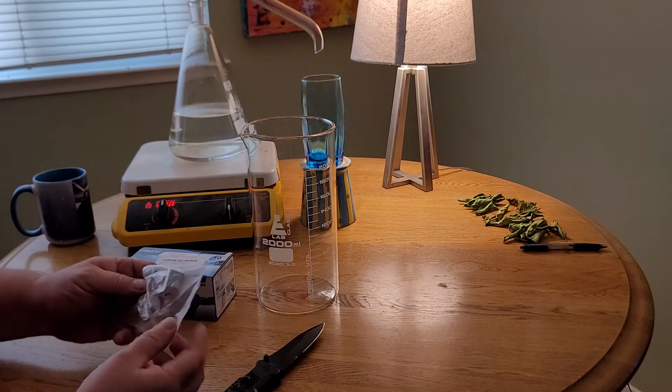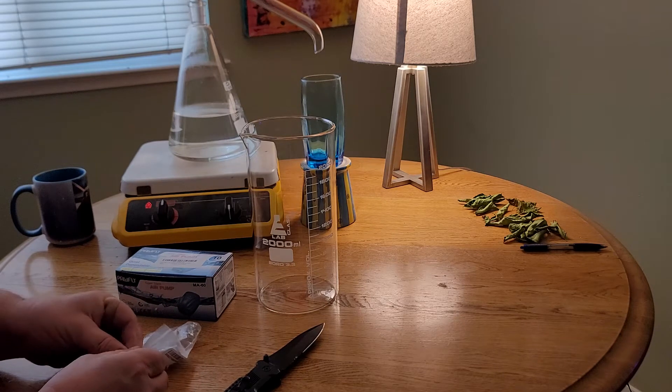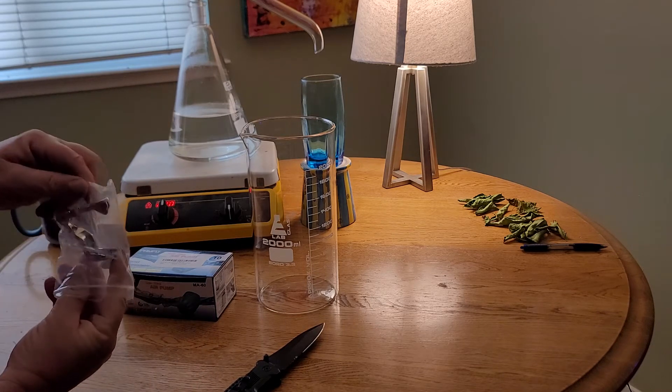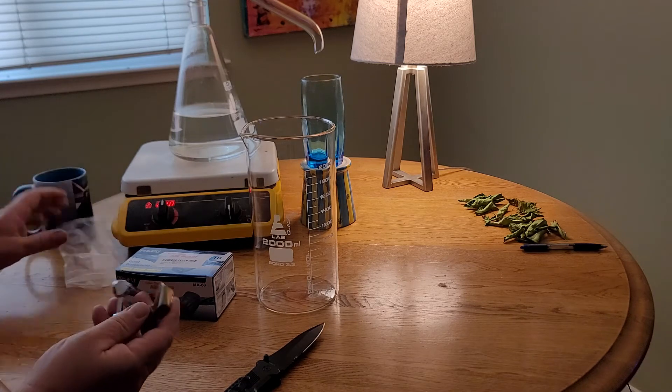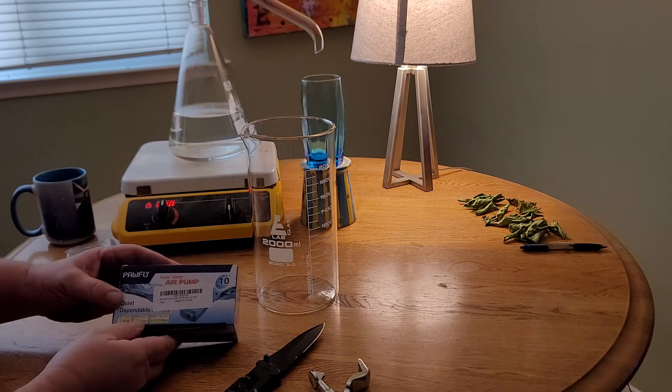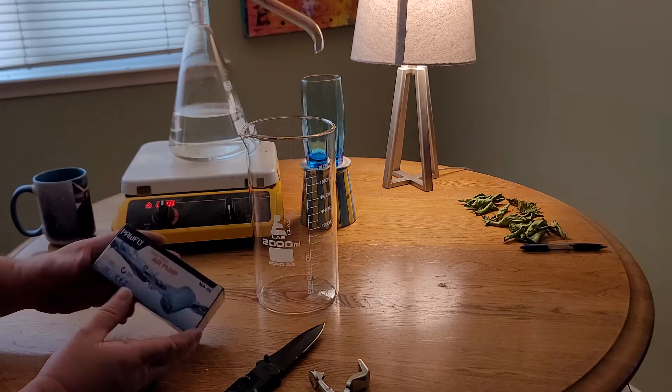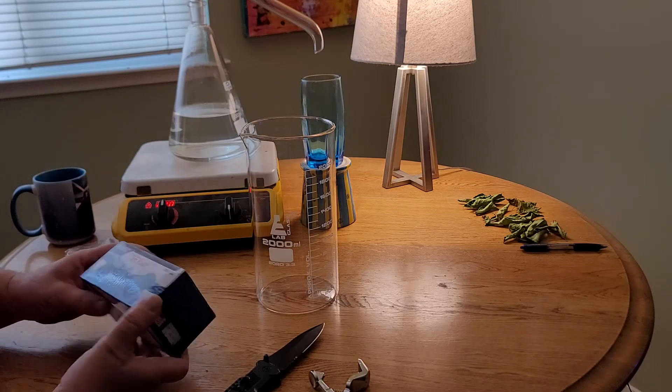So this is a glass cutter, a scientific type glass cutter for cutting glass tubing. And this is an aquarium pump, an aerator pump to pump air.